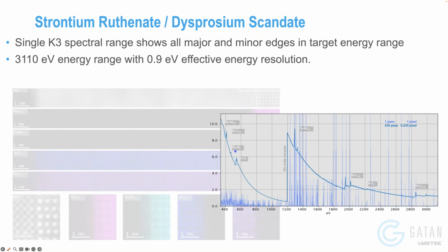But there is overlap, and the key thing is to think about what's the result that you need, what's the important thing, or what's limiting in the experiment. Is 3,000 spectra per second fast enough? If it is, then 3,000 spectra, right? You've got loads of benefits.